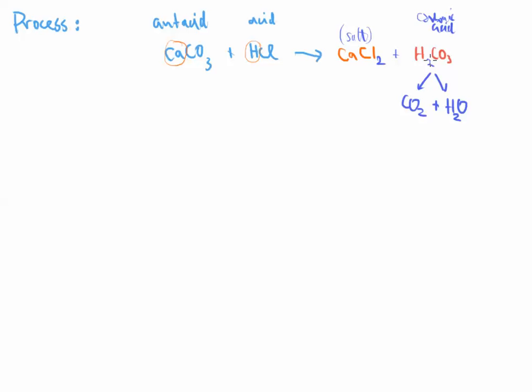We want that to break down to CO2 and escape and leave out of my beaker, or my flask that I'm getting ready to titrate in. So that is the whole concept of heating your sample while you do it. You want to drive off that gas because you do not want to cause an embarrassment with your lab grades. All right? Much less your neighbors.